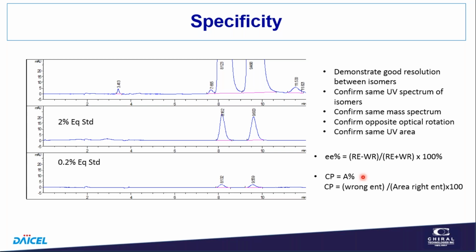But it is archaic, and it is a little confusing. I think a more reasonable way to do it is just measure it as a chiral purity like you would any other impurity: the area or the response of the wrong enantiomer divided by the area of the correct enantiomer. Probably should use correct instead of right because of the right-handed, left-handed issue. Times 100%. And I think just treat it like a regular impurity is the way to do it. But people do it both ways, and we can get into a discussion about that. It's not worth it. Either way, you can transform the numbers. It's like the difference between Fahrenheit and centigrade.